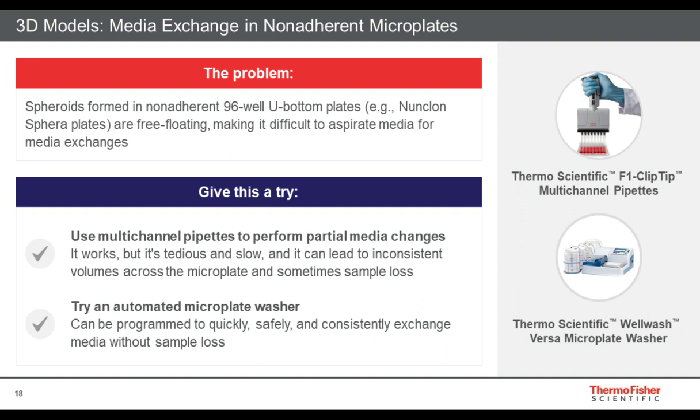However, it still comes with some issues of being consistent and being able to hold a multi-channel pipette level for a fairly long period of time, which sounds trivial, but in practice is not always. And so you can end up with inconsistencies in volume across the plate. So although it is effective, it can be a bit tedious and slow, and it's certainly not without some limitations. Another way around this has been the use of plate washer systems.